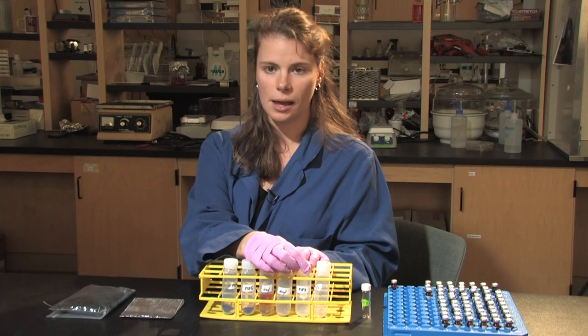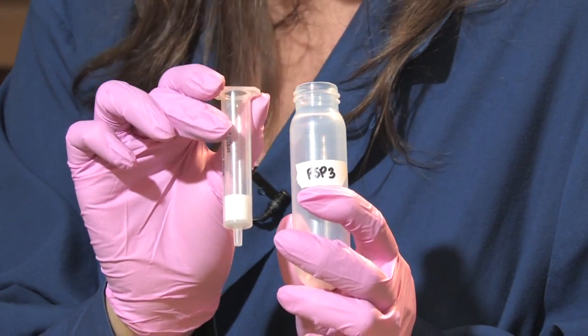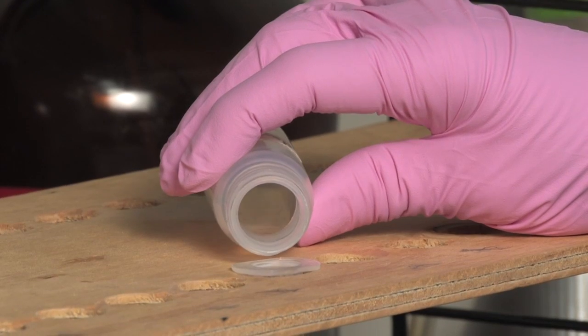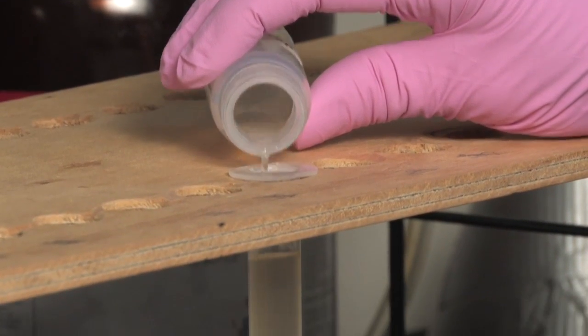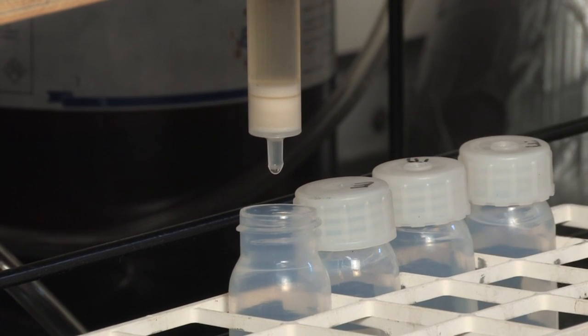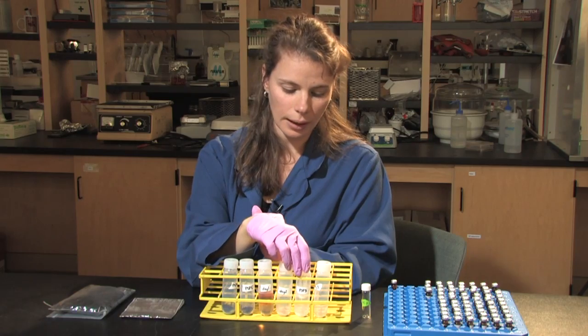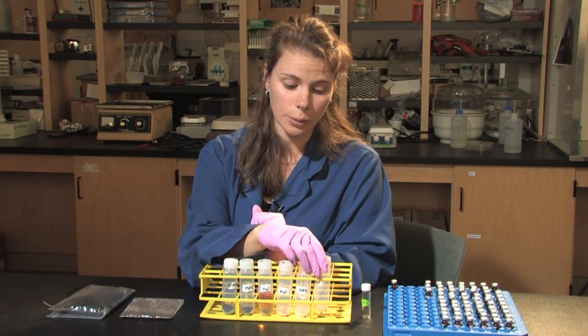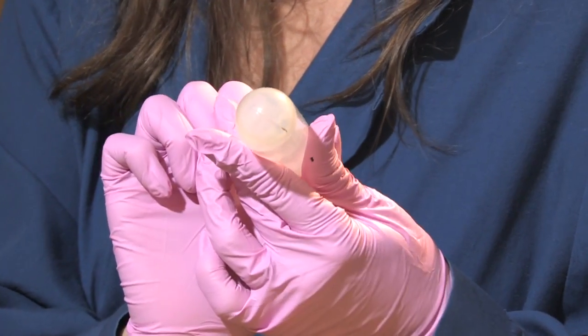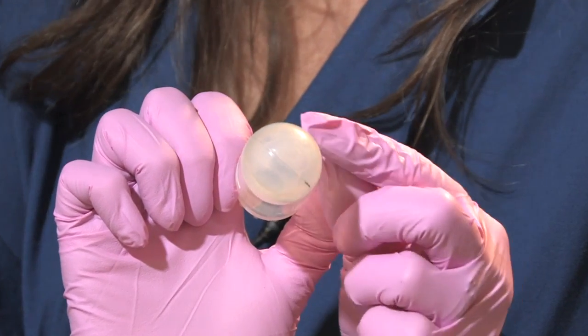From here, the sample is reconstituted in chloroform, then dripped through a silica column. The silica column separates the various types of lipids within the sample — we get the neutral lipids and waxes, as well as the glycolipids, and then ending with the phospholipids. This is done by the addition of a series of solvents containing chloroform, acetone, and methanol. At the end of day three, which is about a four-hour procedure, we are left again with a film at the bottom of the tube after drying down with nitrogen gas.